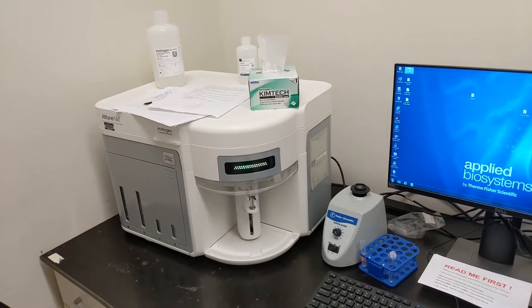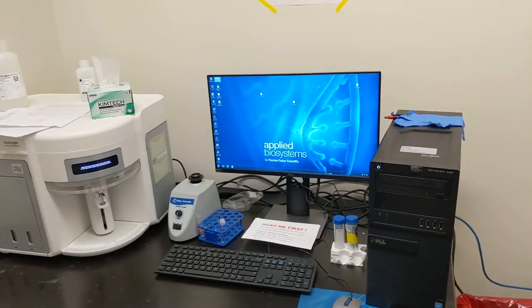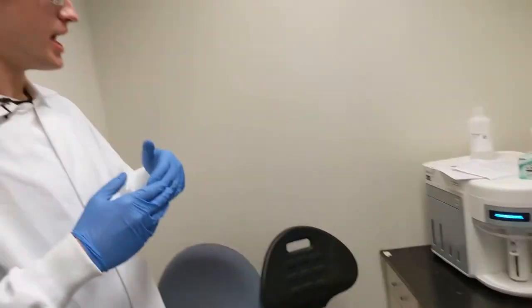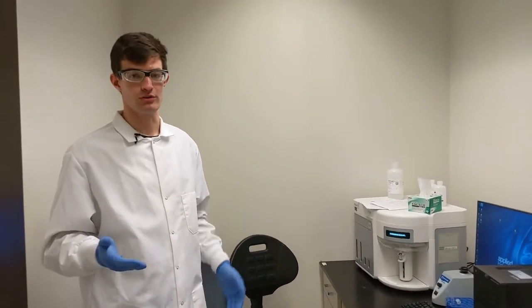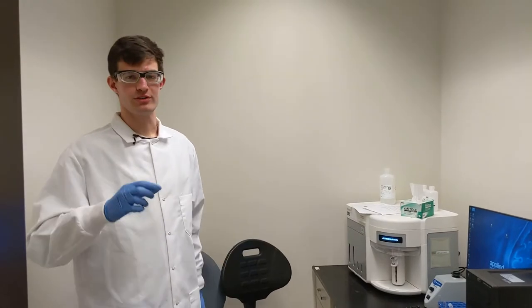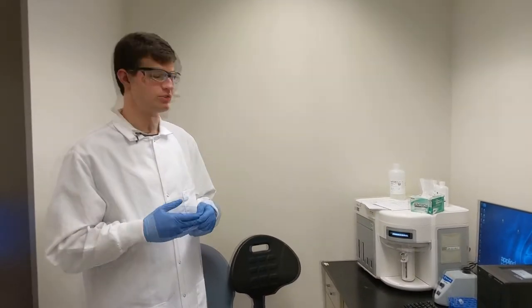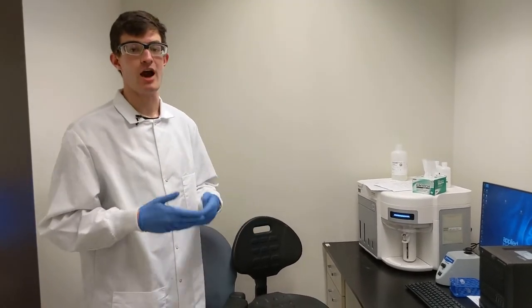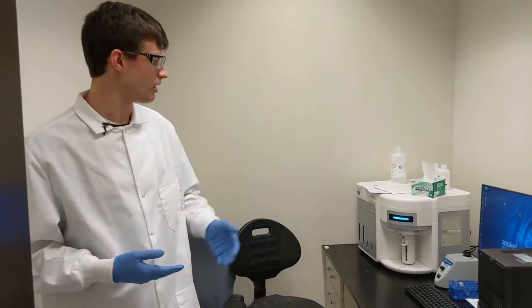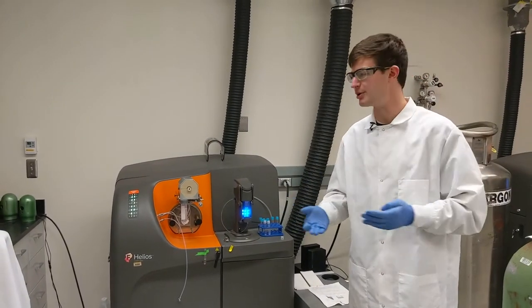A flow cytometer is a really powerful instrument because we can look at what proteins are expressed on individual cells. So cells will run through the flow cytometer one at a time. We'll shoot them with the laser, and that laser can tell us what fluorophores are on the cells. Each fluorophore is attached to an antibody, and then an antibody binds to a specific protein. If we can see the fluorescence of each cell, it tells us what proteins are there and how many of each protein is present on each cell. Here we have a mass cytometer.